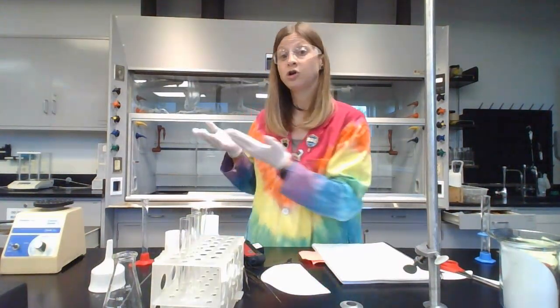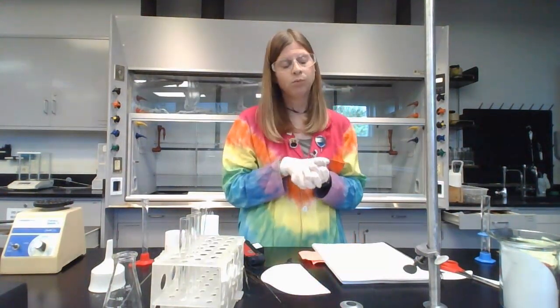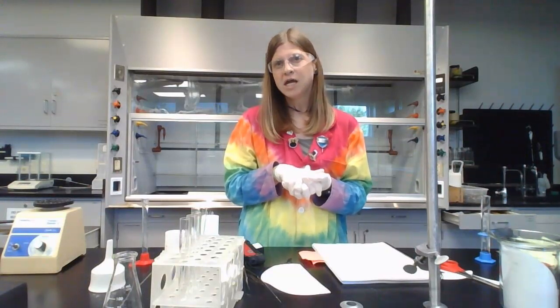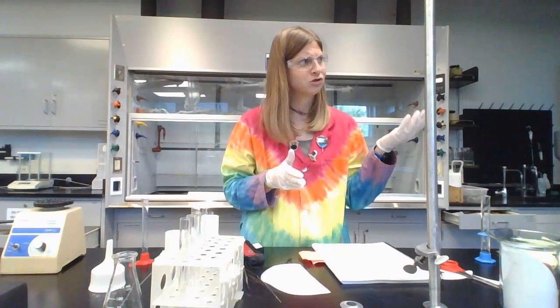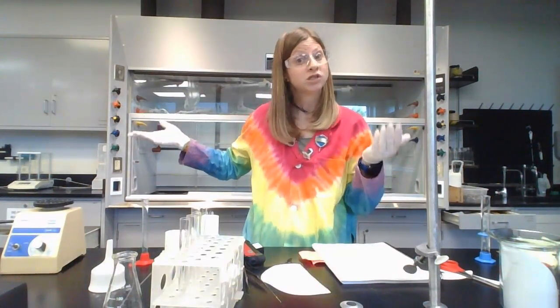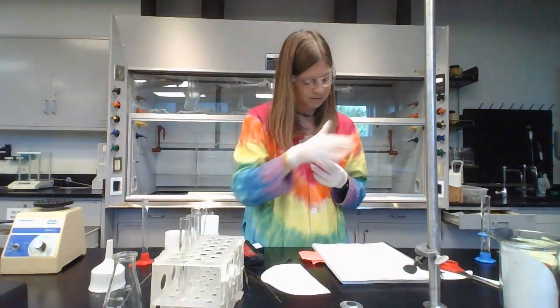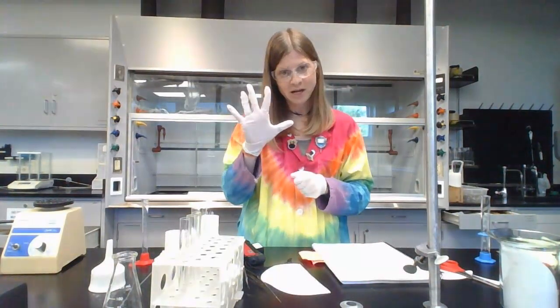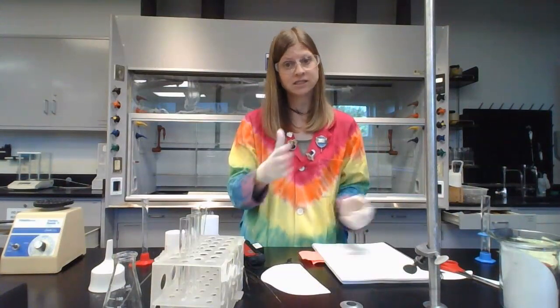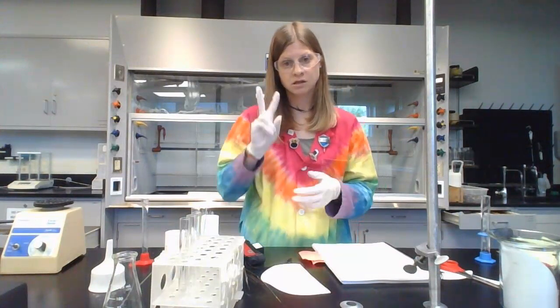Once it's cooled to room temperature, you're going to go over to the balance. Place it on the balance, record the mass. Okay. Now, what we're going to do is called drying to constant mass. And that's making sure that it's actually all the way dry. Like, yeah, sure, it was in the oven for 30 minutes, but for all I know, it's still mostly filled with liquid. So to check to see if it's all the way dry, after you measure the mass, you're going to put it back in the oven for another 5 minutes. So it was in the oven for 30 minutes, and now we're putting it in for 5 minutes, taking it out, cooling it, putting it on the balance to measure the mass the second time.